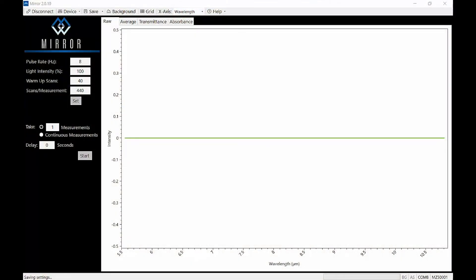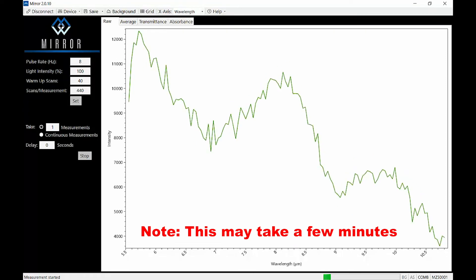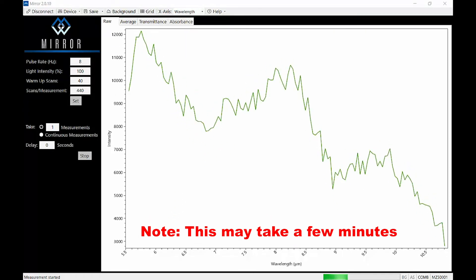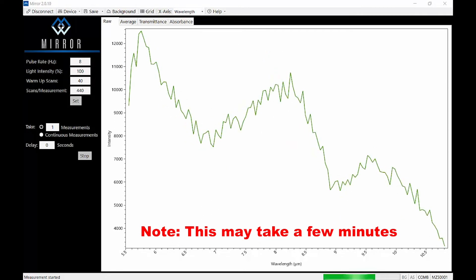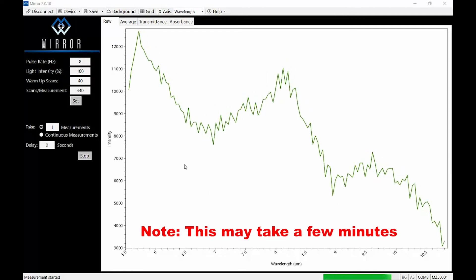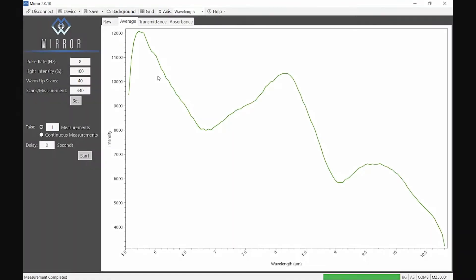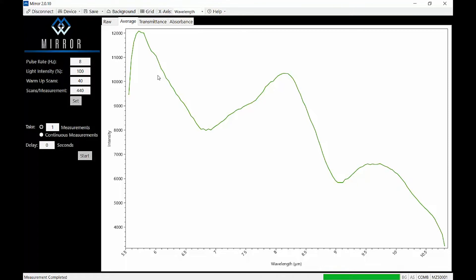As with most spectroscopy measurements, you start by measuring a background or reference spectrum. With your measurement parameters set, make your background measurement by selecting the option to take one measurement and click Start to begin. Now the software comes to life with the unprocessed background spectrum displayed in real time. When the acquisition is complete, the OceanMirror software switches to the average tab showing you the averaged background spectrum. Set this spectrum as your background by clicking the Background button.